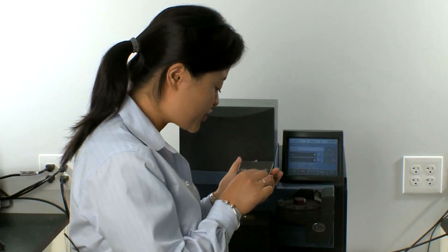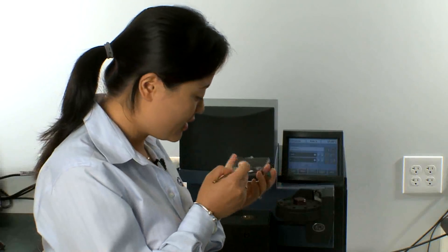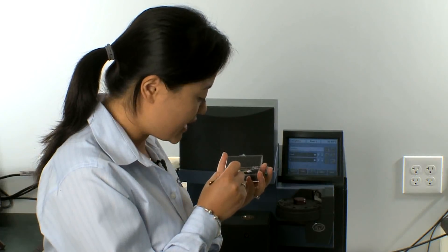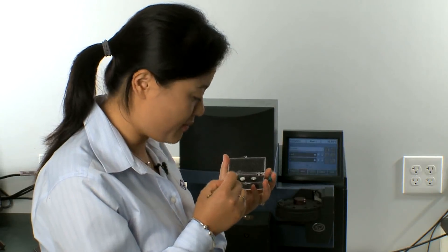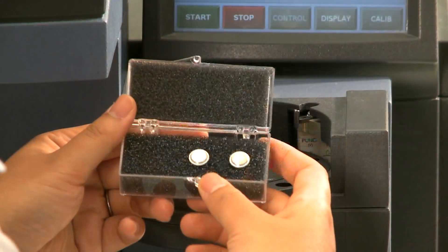There are two calibration pens. Each has a number underneath that says pen 1 and pen 2.